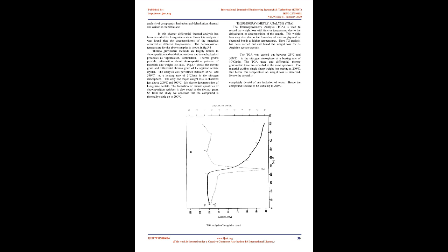Applications of DTA are qualitative and quantitative analysis of compounds, hydration and dehydration, thermal and oxidation stabilities, etc. In this chapter differential thermal analysis has been extended for L-Arginine acetate. From this analysis it was found that the decompositions of the materials occurred at different temperatures.